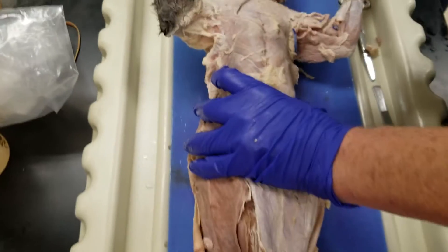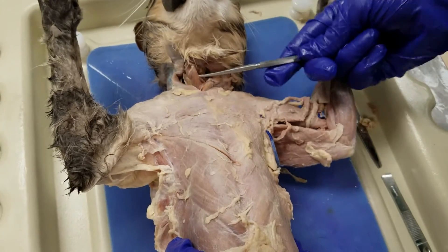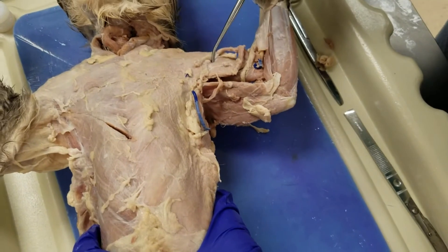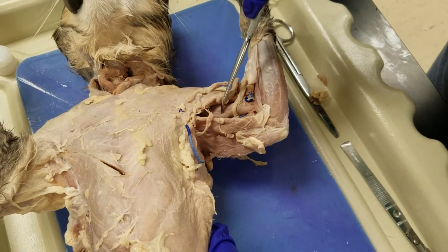Pectoralis minor, pectoralis major, sternomastoid, deltoid, triceps brachii, biceps brachii.